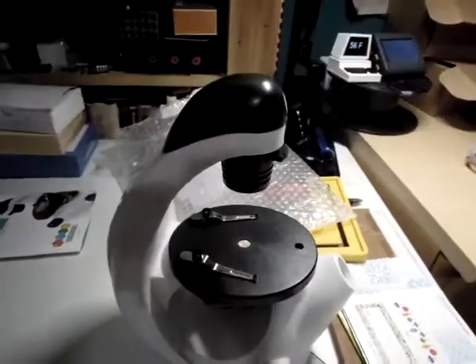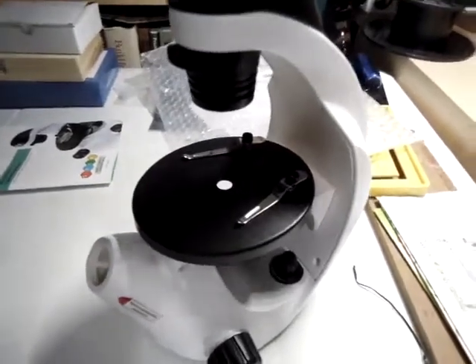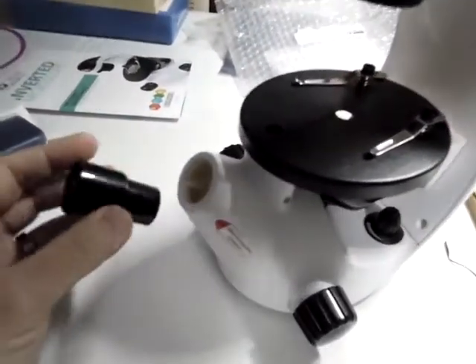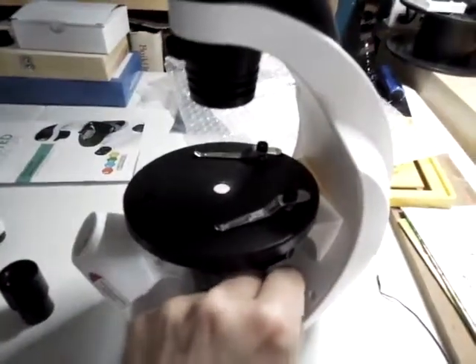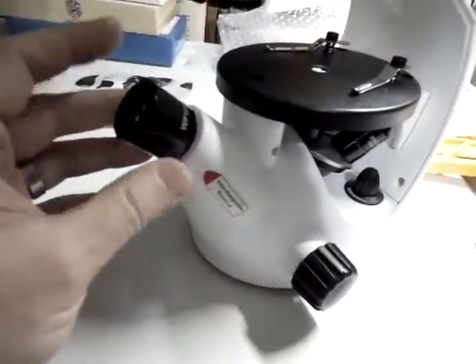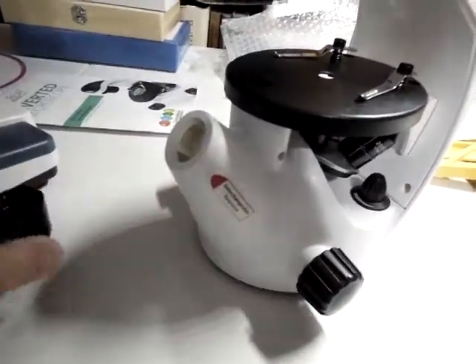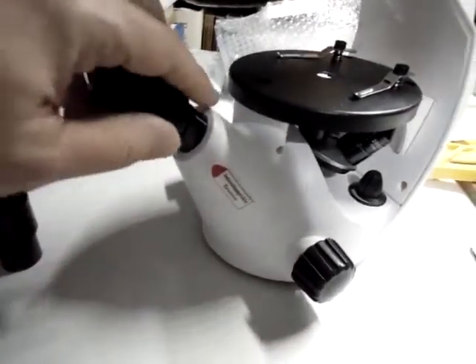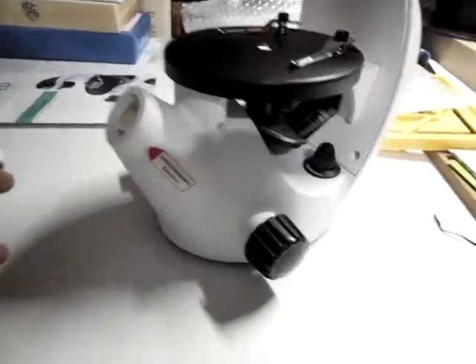The second one is this guy here. This is an inverted microscope, kind of designed for homeschooling or classroom. It's not anywhere near as fancy — it's plastic. The light comes from the top; the lenses are in the bottom — hence the inverted. The eyepiece lens is plastic, but it is a standard hole, so you can put in standard eyepieces from the bigger, better scope, and cameras.